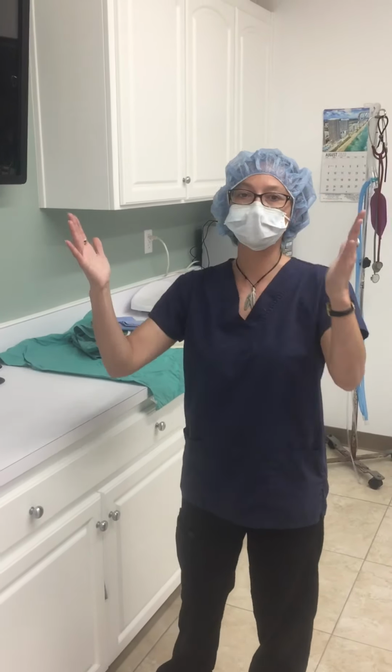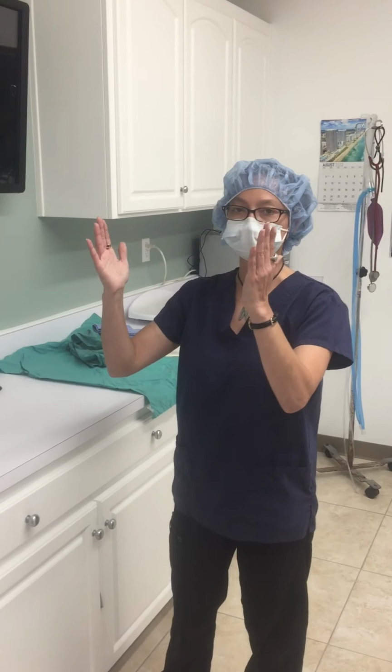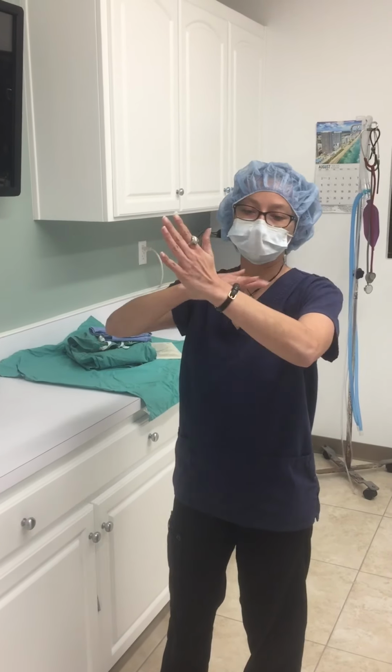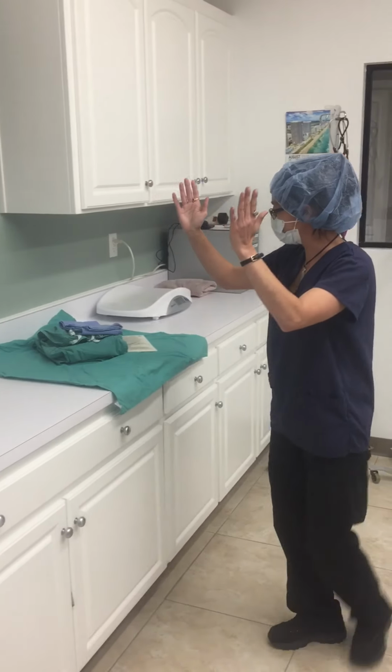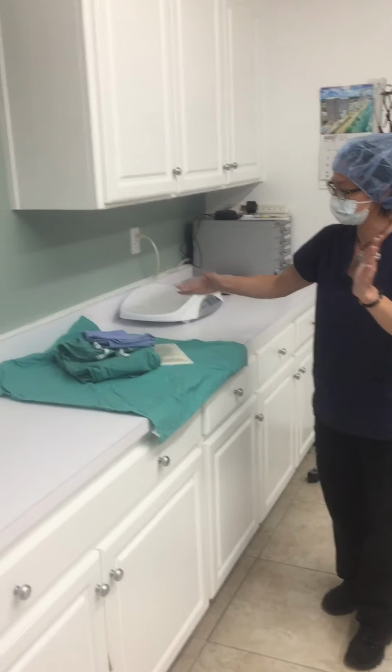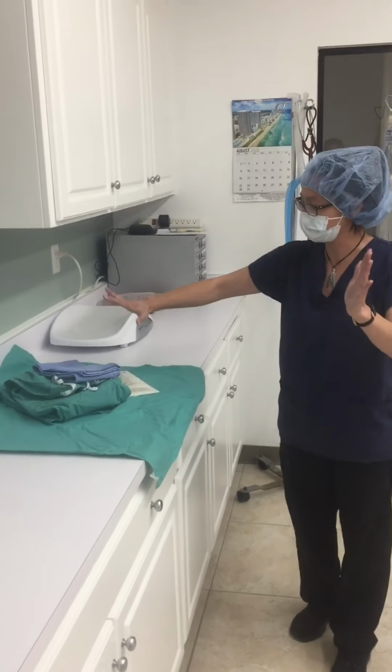We want to keep our hands up above our waist, so as not to drop them down for contamination to drip down your fingers. So we're going to pretend like my hands are wet from scrub. We're going to come right over here to our already opened pack. This is the sterile zone right here inside the green square.